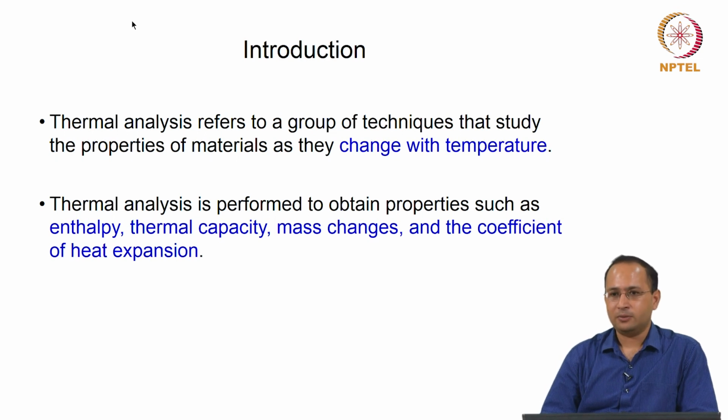Another example could be coal. If you burn coal, gases will come out of coal, like inflammable gases, right. So depending on the material, you will see a particular response, right, and that is very unique to a particular material, how it responds to a change in temperature. So that is the focus of this technique, right.